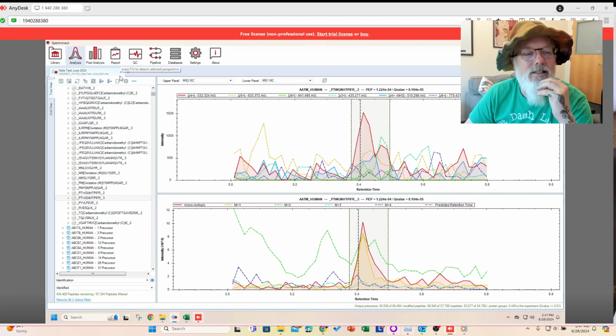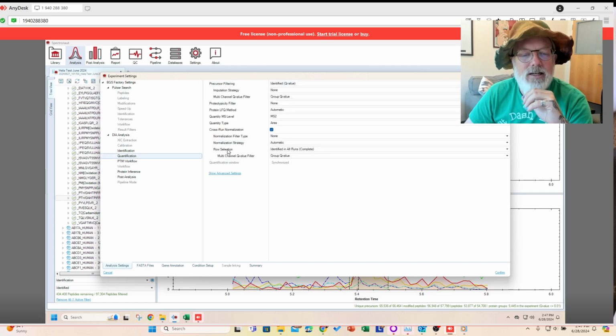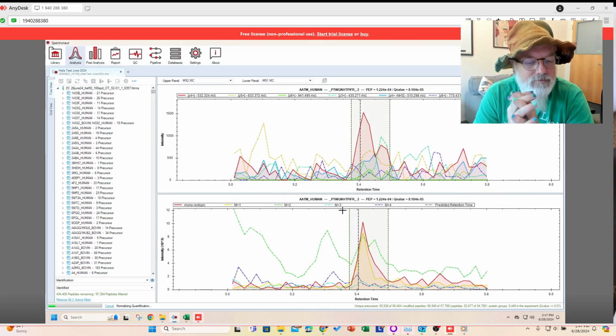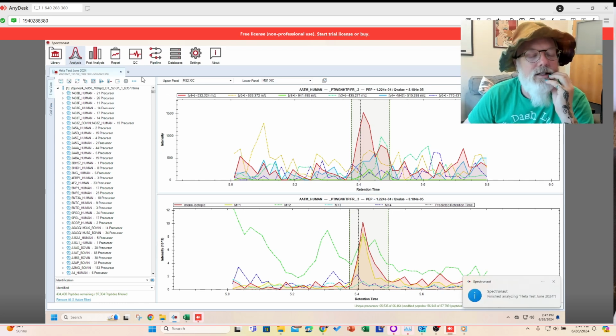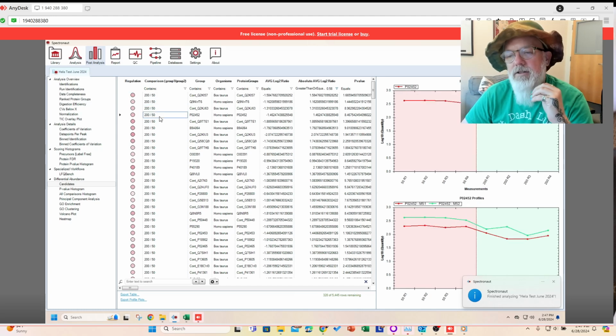So we're going to go back to the analysis tab, hit the gear. You may want to play around with this. I'm probably not going to turn it on by default, and I'll tell you why. So then we'll turn it on again. Okay, let's give it a couple minutes. All right, now let's see if that looks better. Okay, it looks a little better.